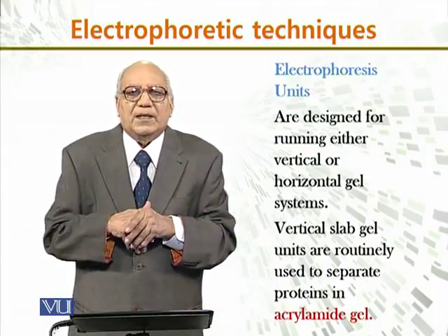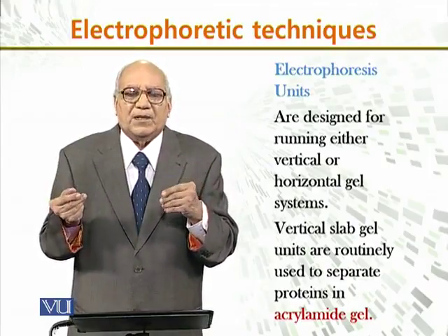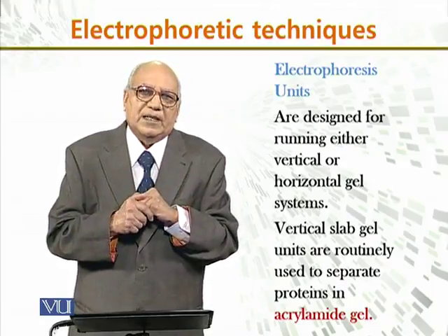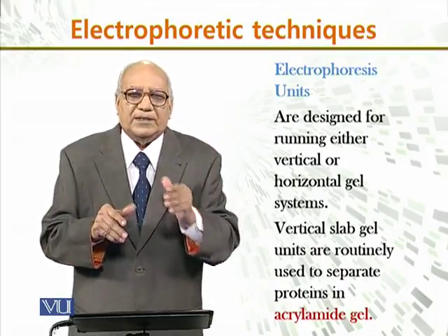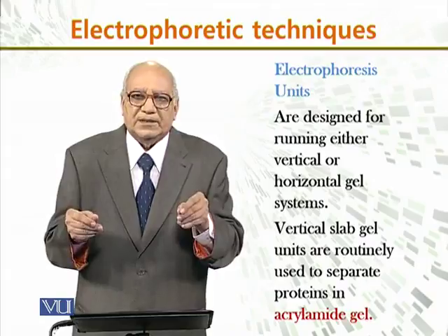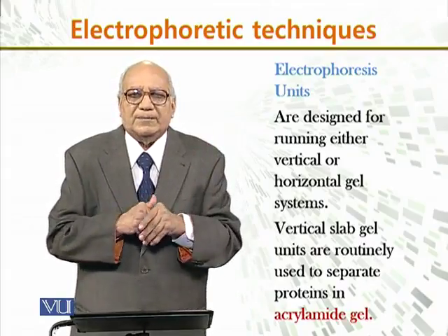Electrophoresis units are generally designed for running either a vertical or horizontal gel system, and the gel is used to support the particles so that they can migrate.